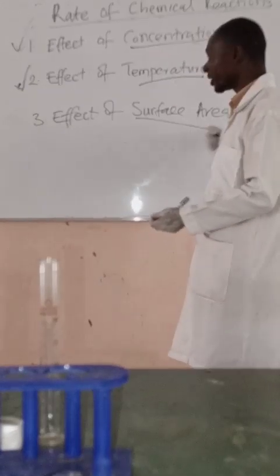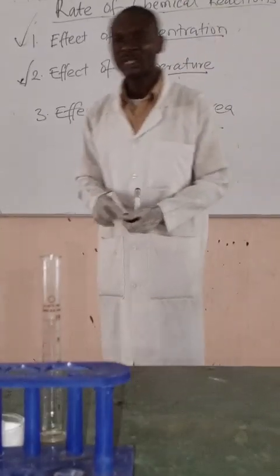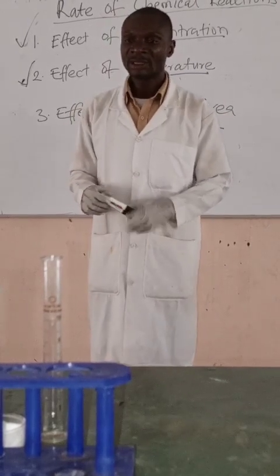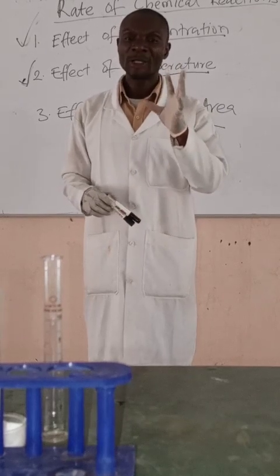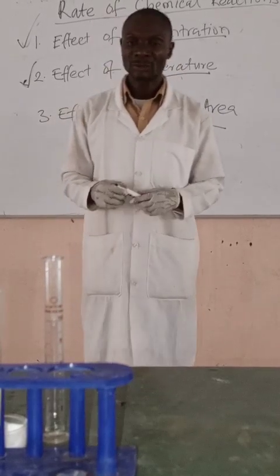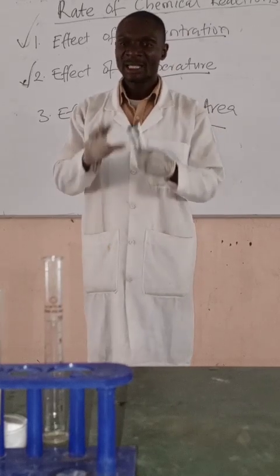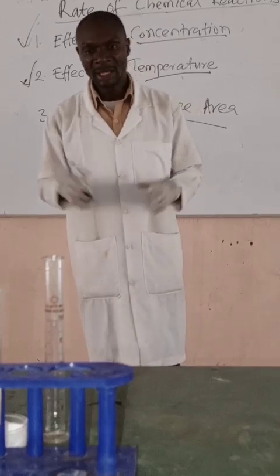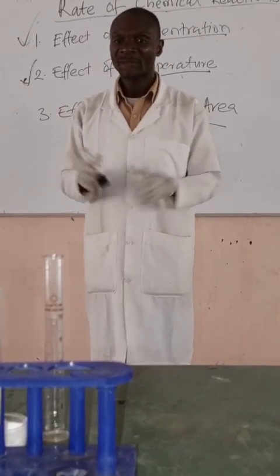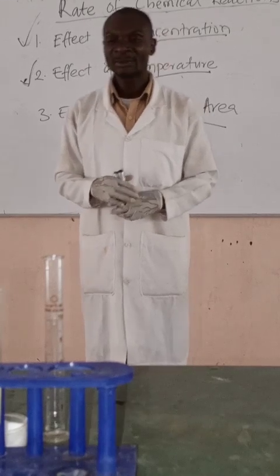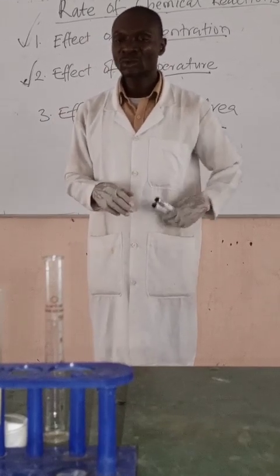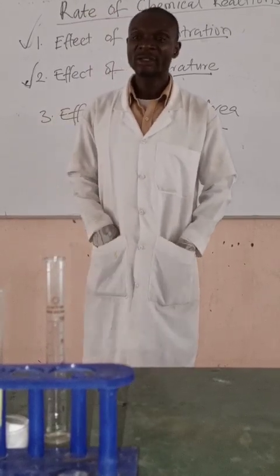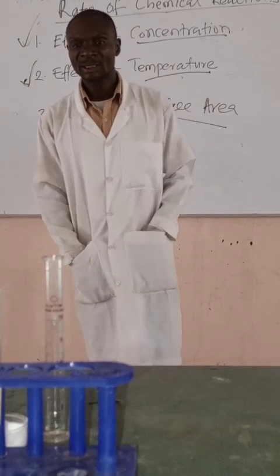Now we go to effect of surface area. We are using zinc solids and zinc powder. Zinc powder is made up of fine powder of zinc particles, while zinc solid is a block, a bigger particle of zinc solid. We are going to react both of them with 3 molar hydrochloric acid solution to test for effect of surface area on rate of chemical reaction.